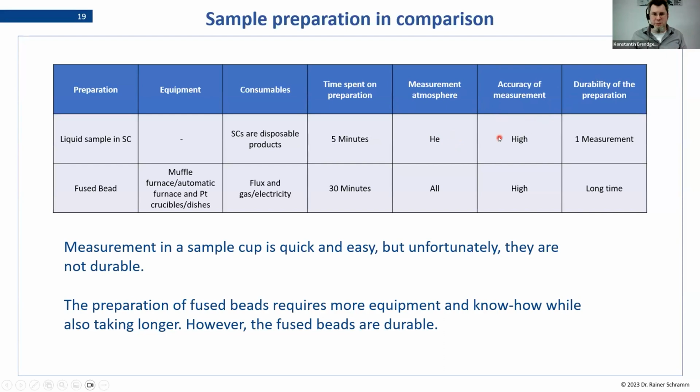The accuracy is very high, since we have an ideal sample, and yeah, the durability of the preparation is one measurement, and then basically throw away. Or as I mentioned before, if we want to do repeats, you can refill the liquid into the next cup and do it again.